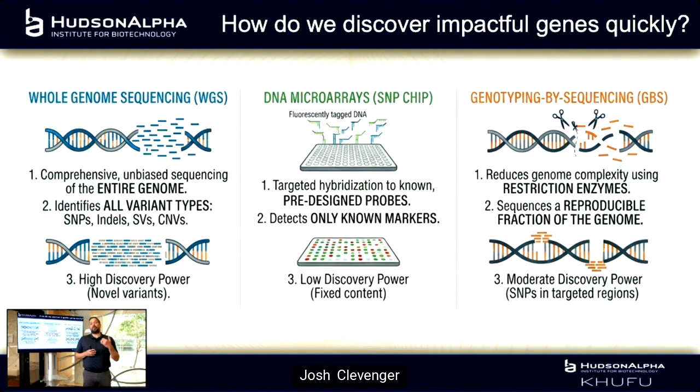Now, to make it more affordable, you can do what we talked about that's in the title of this webinar, which is actually sequencing that to lower coverage. So if you sequence that to lower coverage, the cost of the sequencing per sample is reduced, and you can start to think about ramping up the samples that you're going to use.